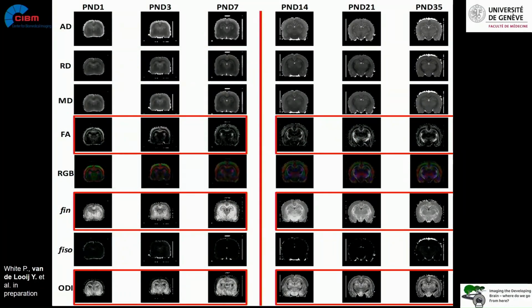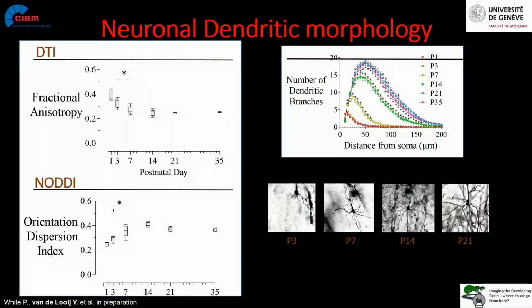And if we look at the quantitative values, for the fractional anisotropy we have a decrease from postnatal day 1 to postnatal day 7.